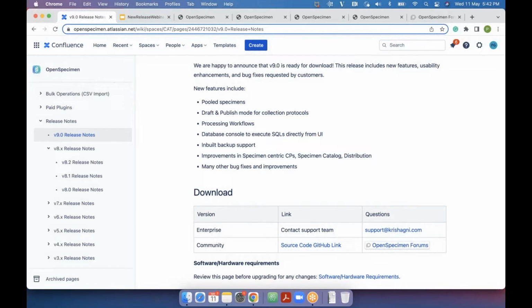There is a question: is it only just the backup for the entire database, or can you restore from the backup files without help of the system team? No, for restoration, you still have to contact the system team or us. The backup file would be created on the server, and that can be used for restoration. But of course, for doing that, you'll still have to contact us.